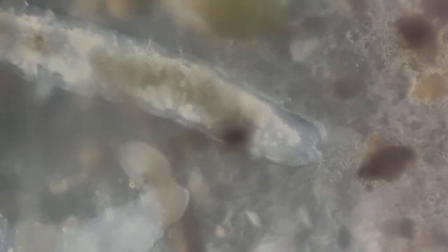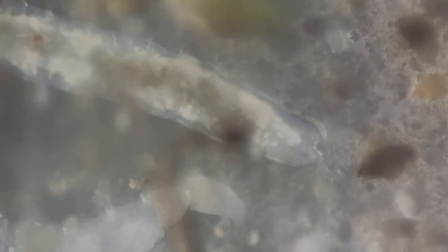This is the caudal part, the tail region, and you can see those eggs. So this is real life, non-destructive observation.